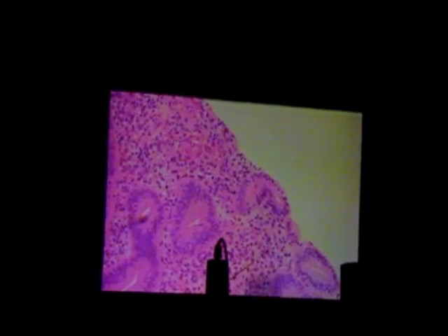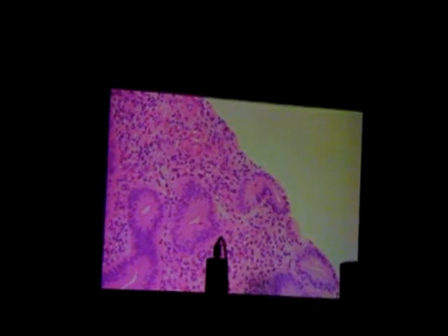But we're not going to have the slide there — I'm going to have it in here. So if I said to you on test day, and I will — let me find a good one, the one that I would test. If I said, name the structure right there and the layer. Answer: uterine gland. Layer: endometrium. Do you see what I just named? Uterine gland, endometrium. And then name the phase. The phase this is in has got to be what they call the proliferative phase.